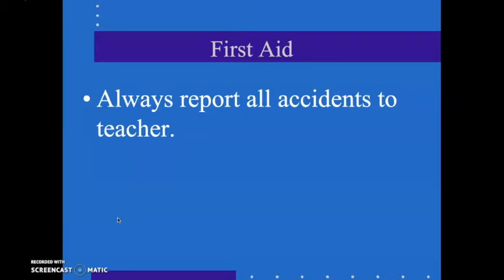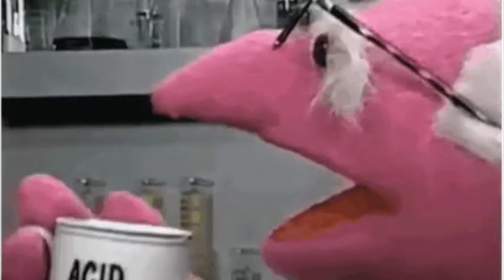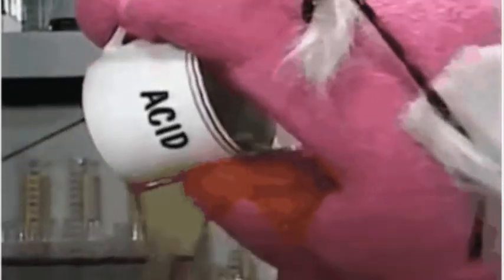Let's look at the next category. First aid. What can you tell me about first aid? Pause the video. All right, here we go. Always report all accidents to the teacher. If something happens, make sure that you let the teacher know. Make them aware of it.